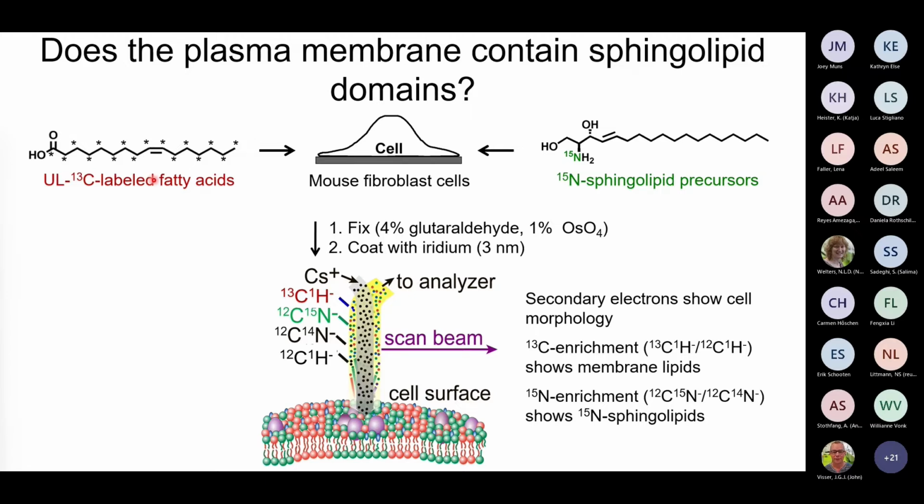There were a variety of structures, which means that they had different degrees of saturation, different lengths. And so this carbon-13 labeled fatty acids wound up in all the lipids. That was so we could assess, if we found an excess of sphingolipids, is that, again, because they were concentrated in the plasma membrane, or did it not mean we were detecting excess lipid?